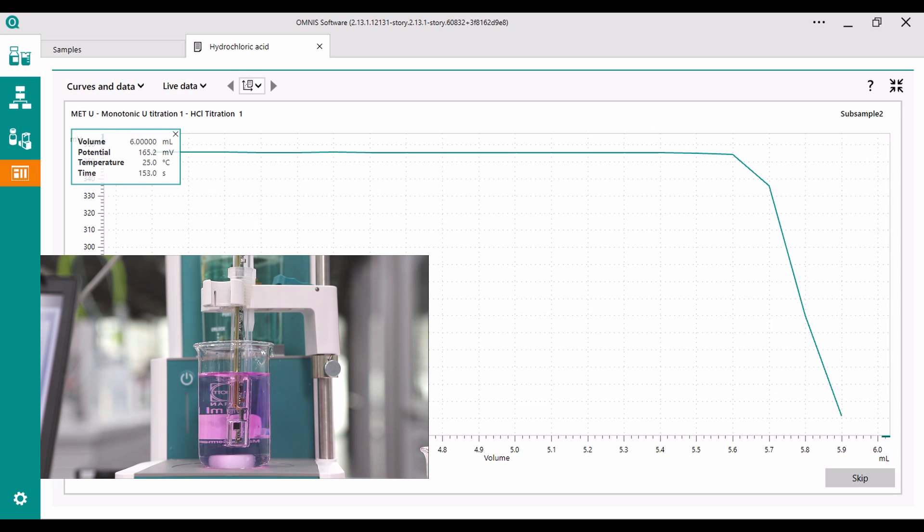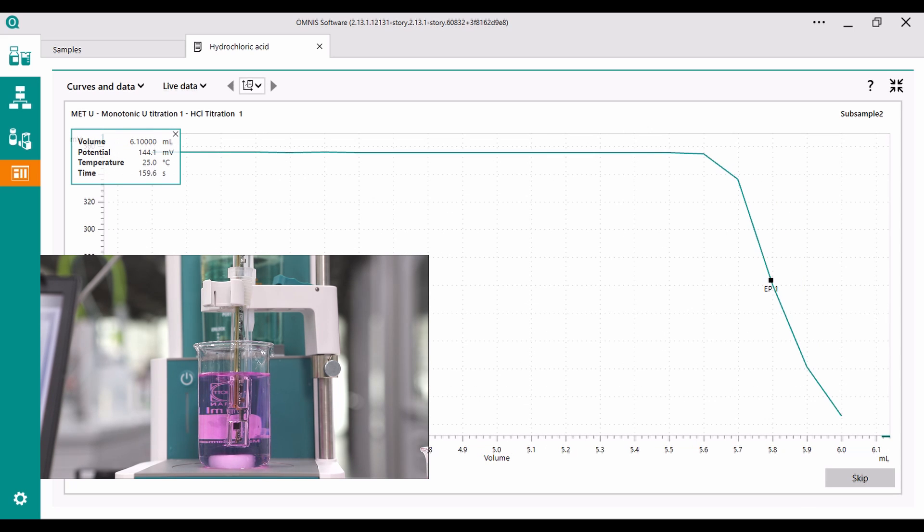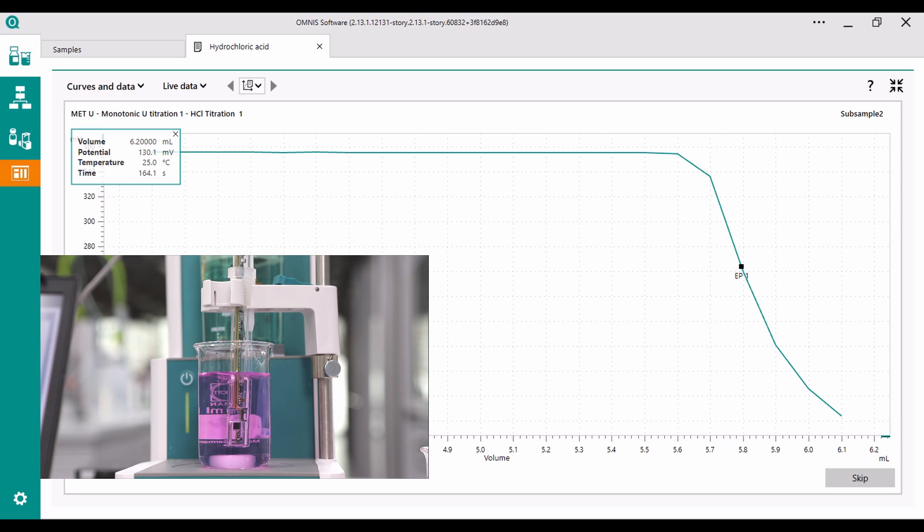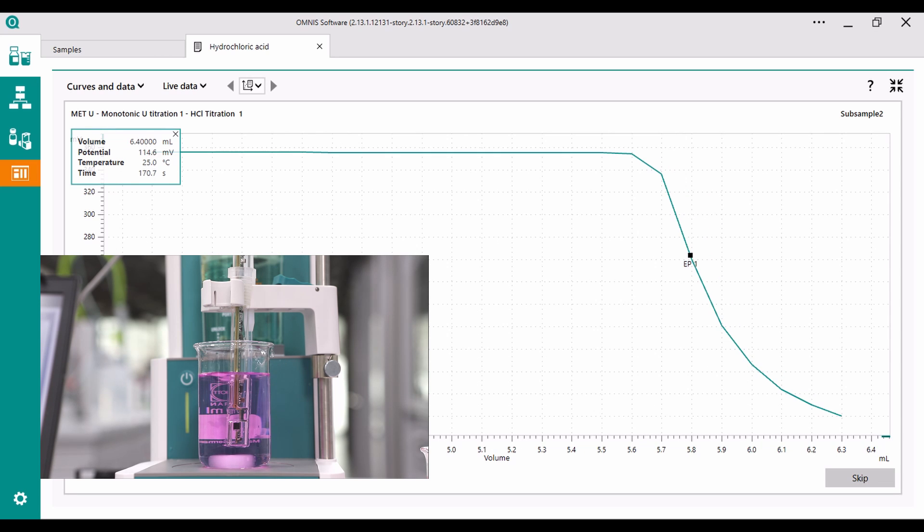This is the reason why you don't need to change your titration method. The color change of the indicator is detected reliably as a change in potential.